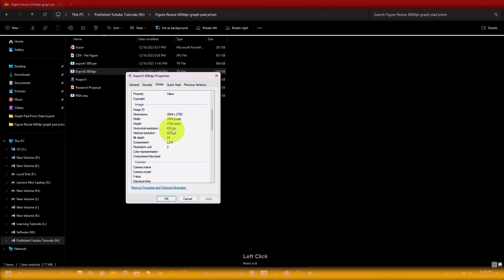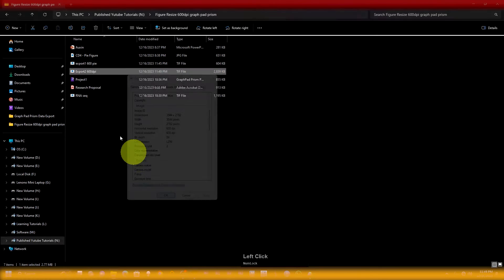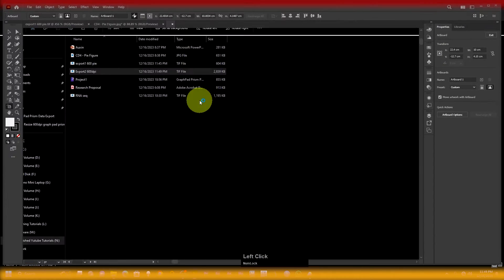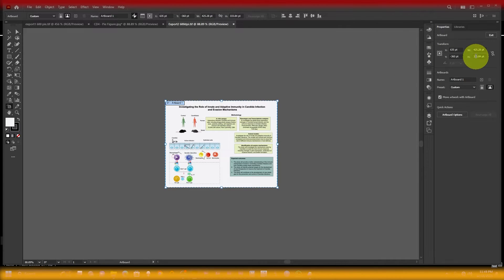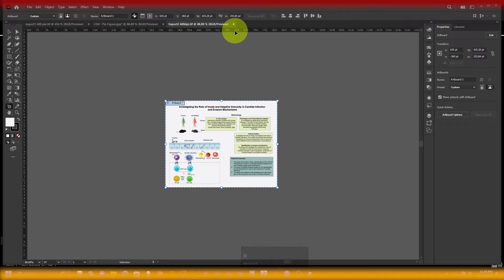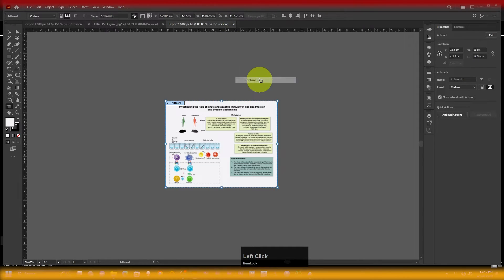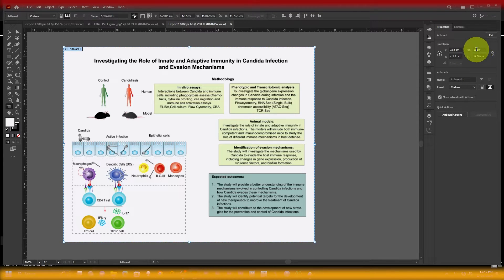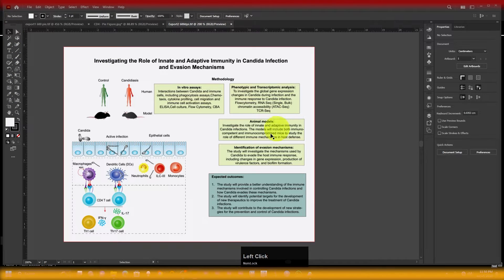Select the same folder and click OK. You can see the image is exported as a TIFF file. If you check the properties, the file format is TIFF, and in the details you can see the resolution is 600 dpi. Opening this in Illustrator and changing the scale to centimeters, you can now see the width is 15 centimeters — exactly as we assigned during the export.